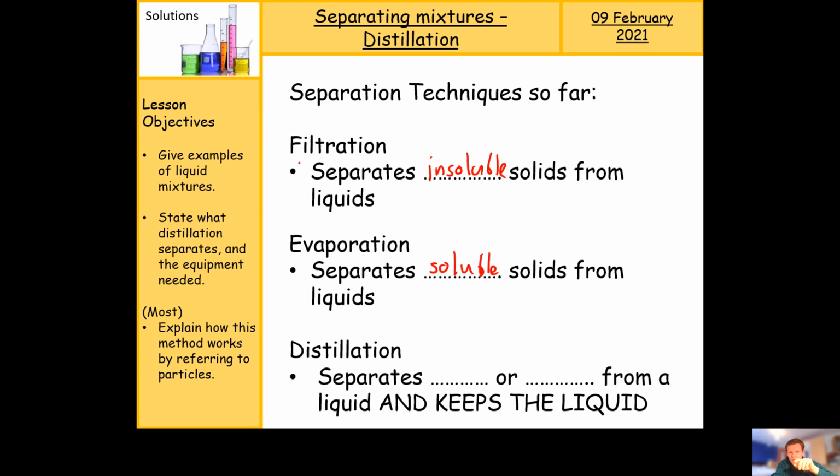That doesn't go with filtration because the salt goes through the filter paper. So how do you separate that? And we go, well, we do it with evaporation, like we just talked about. We can have an evaporation dish, and we'll have the salt then crystallize down here, and the water evaporating away. So we'll have got the salt back. We'll have separated the two.